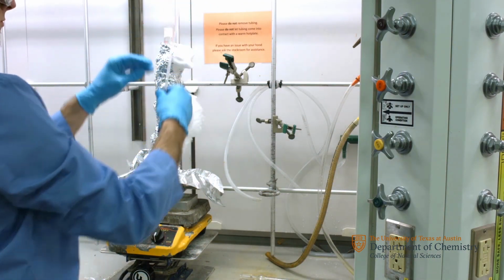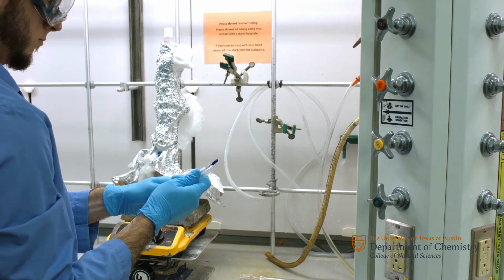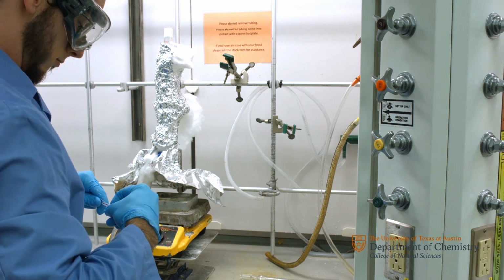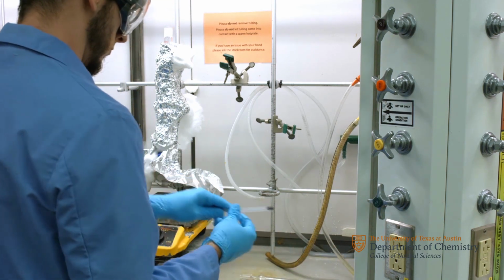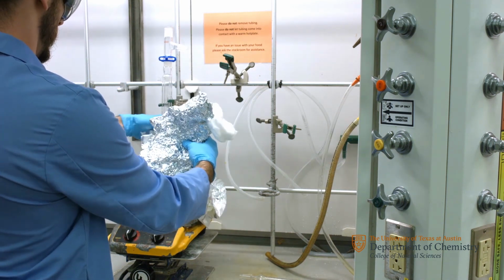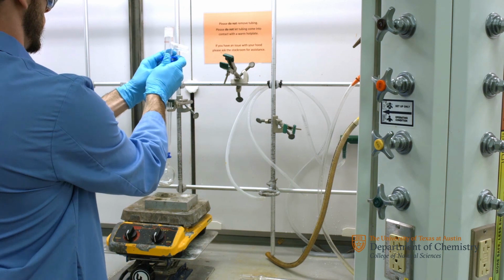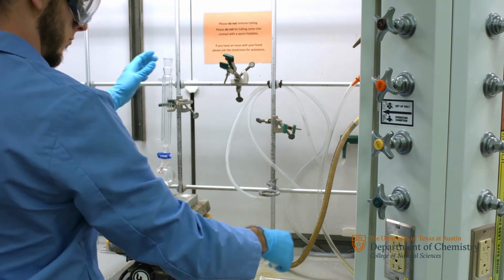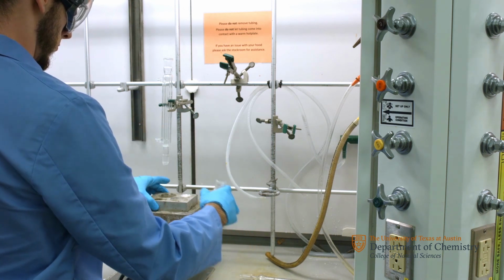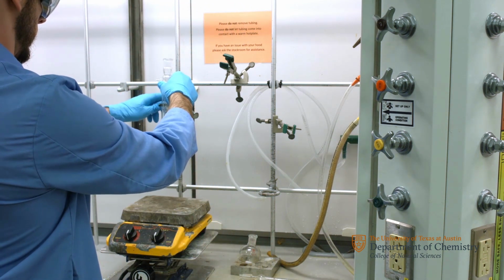Now remove and disassemble the thermometer adapter. Remove the aluminum foil and cotton. And then remove the distillation head, followed by the distillation flask. Finally, take down the distillation column.